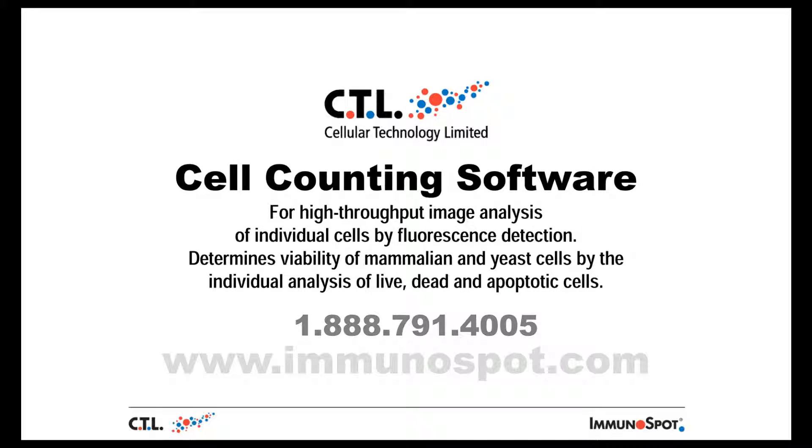This is a demo of the CTL cell counting software. The software is optimized for high-throughput image analysis of individual cells via fluorescent detection.